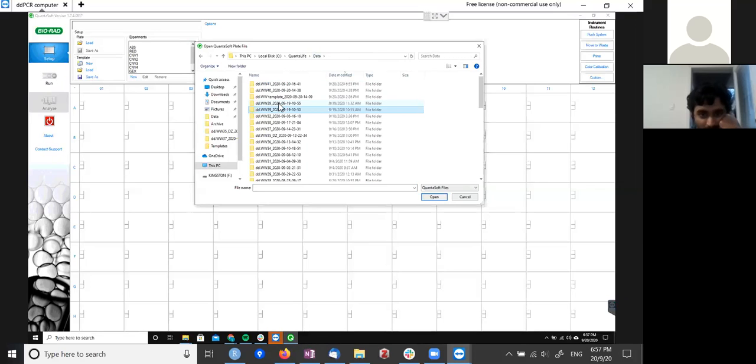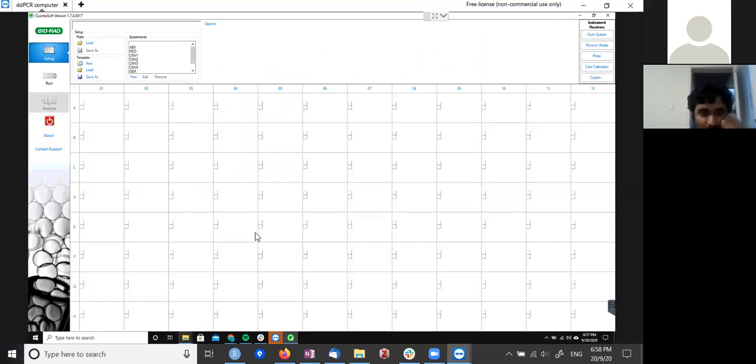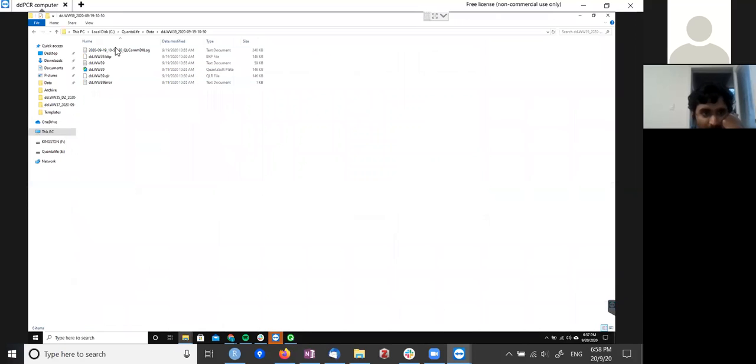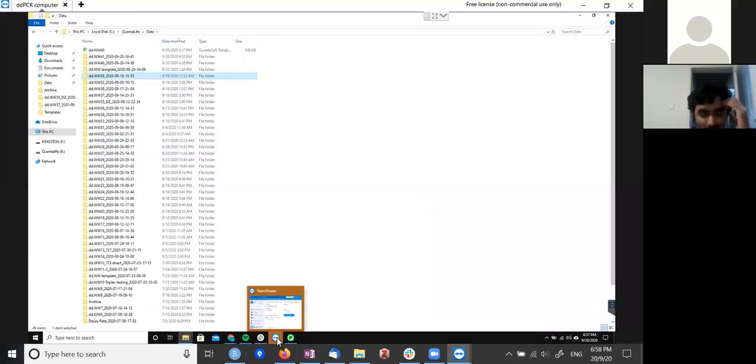So when you start the machine, sometimes it gives you an error, and then you have to abort the run, and then it makes a dummy folder with the same name, but not many files in it except the error file. So whenever I see that, I go and delete it just to avoid confusion. Okay. But make sure you're deleting the correct file. Yeah.